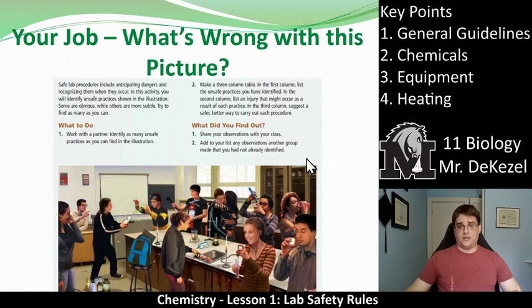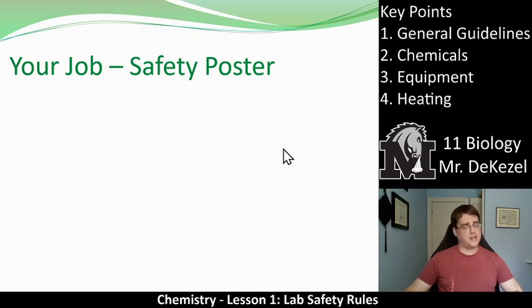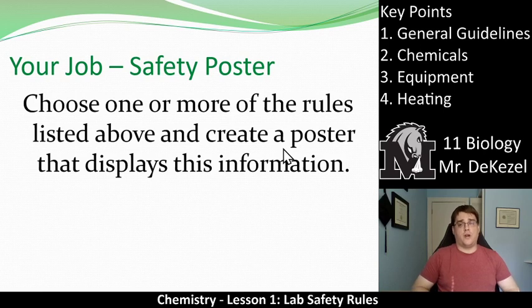There are two activities for you to do. First, look at the picture in your notes — there are a whole bunch of unsafe lab procedures going on. I'd like you to identify the unsafe lab procedures; there are at least 15. Write them all out and we can add them to a combined class list. Second, create a safety poster: choose one or more of the approximately 30 rules listed and create a poster displaying that information. We'll use these to inform others about the rules we follow in the lab. If you have any questions, please let me know. Thanks very much everyone.